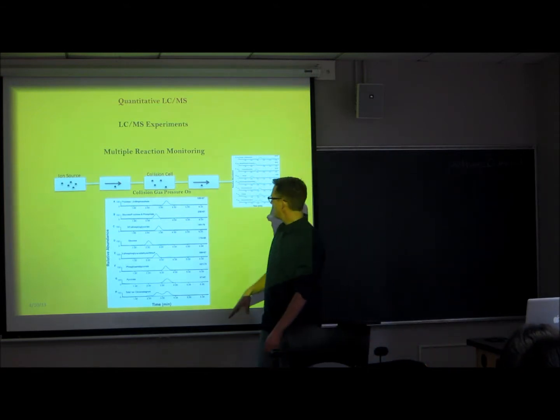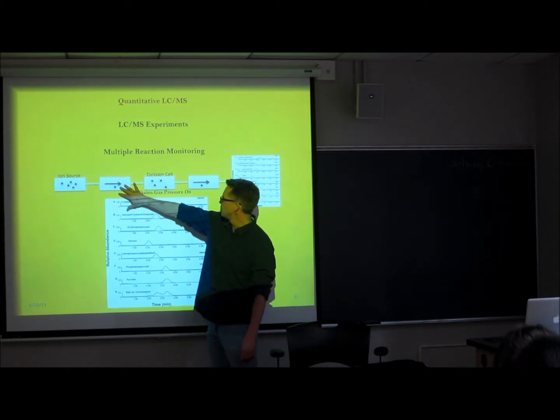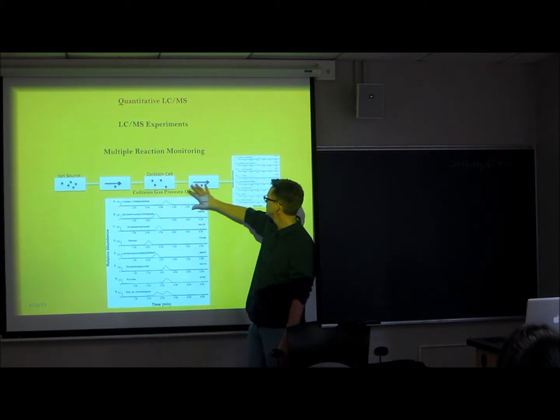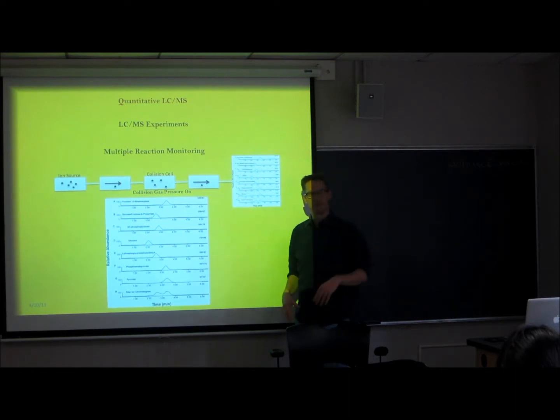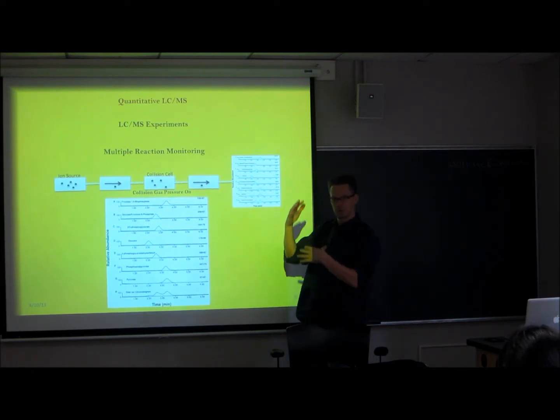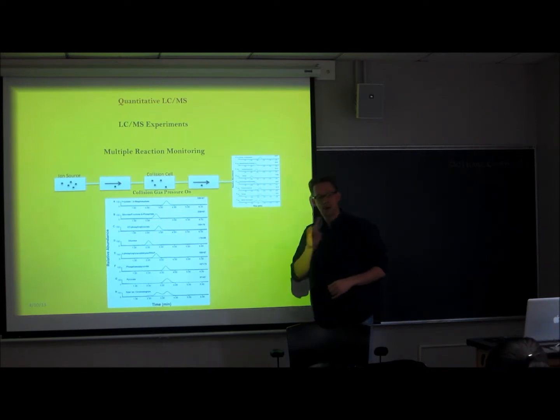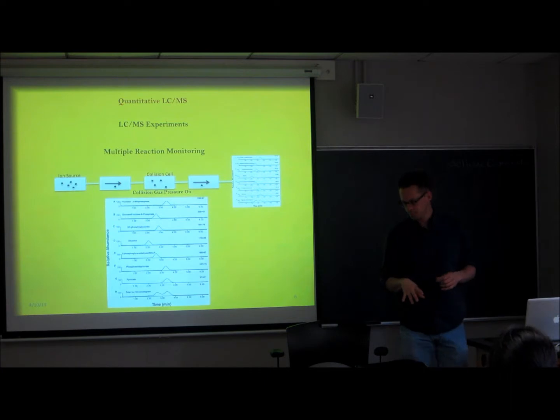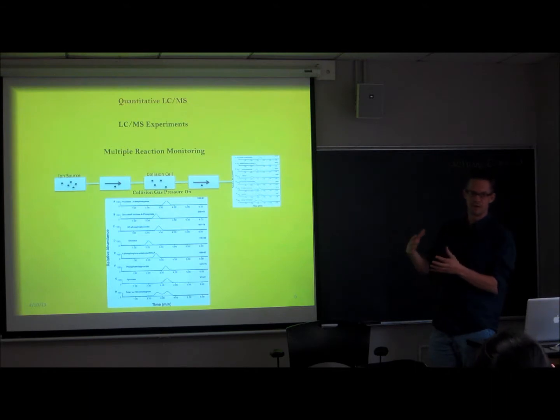So we'll form our ions. In the case of the 459, before, we would filter through 459, break it into pieces, and then we might set this up to filter only through that big 139 peak, or the 307, or the 289, whatever we saw in that previous scan. When you're doing quantitation, you want to set up for every compound at least 2 transitions for verification of identity.